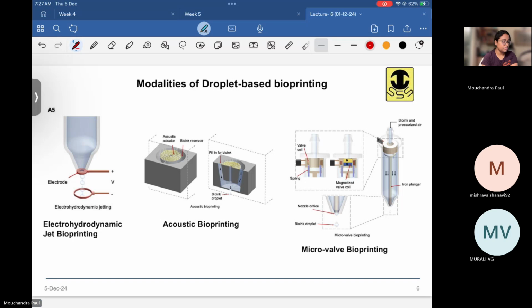And as you apply air pressure on the bioink fluid chamber, the ink comes out at a steady flow rate. But as soon as it experiences the electric field outside, it breaks up into droplets. And these droplets are basically charged at the tip of the nozzle, and this charge is enough to overcome the surface tension, and because of which droplets are formed.